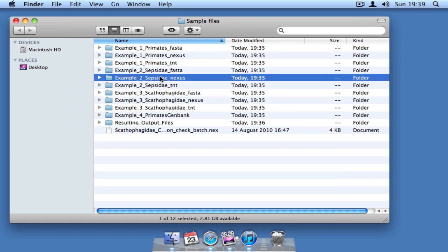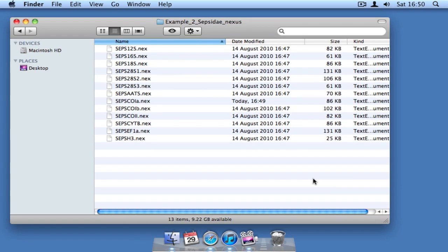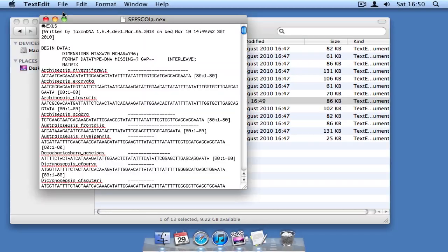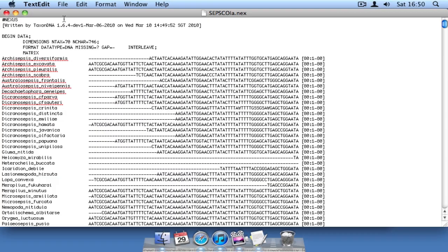We'll start by opening the folder Sepsidae, which contains Nexus files with sequence data from 13 different markers. I'm going to open one of these files to make a few important points.